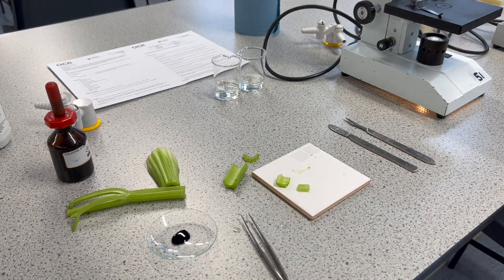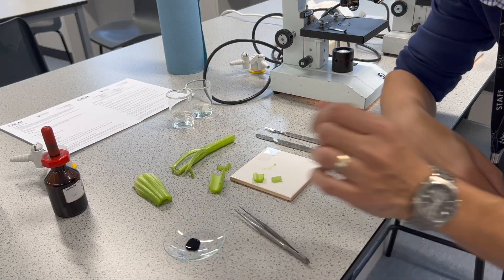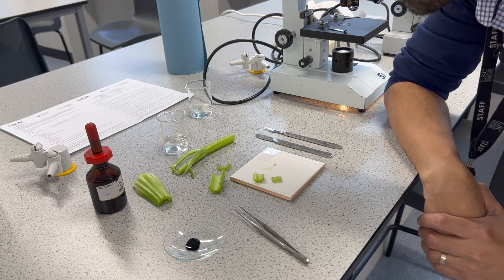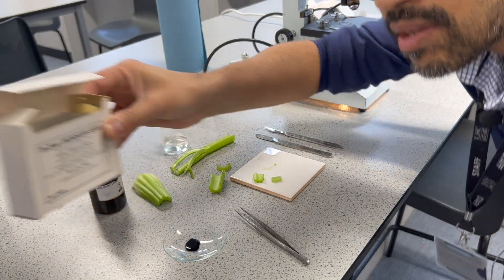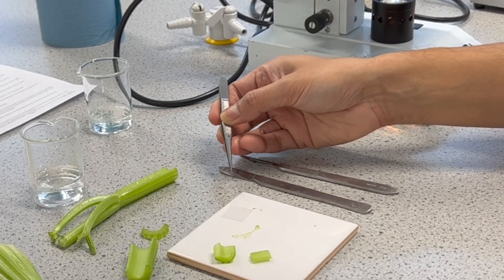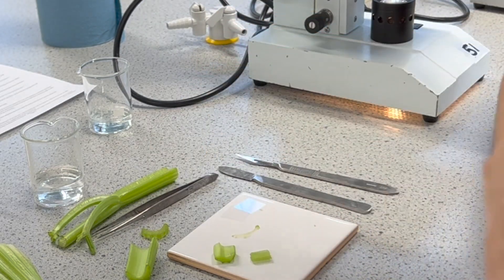We'll need some sharp scalpels, our celery as the stem tissue, some toluidene blue stain, a beaker of water just for washing the excess stain off, microscope slides, and cover slips — those are the very small, very thin squares of glass that we place on top of the sample to more easily view it.